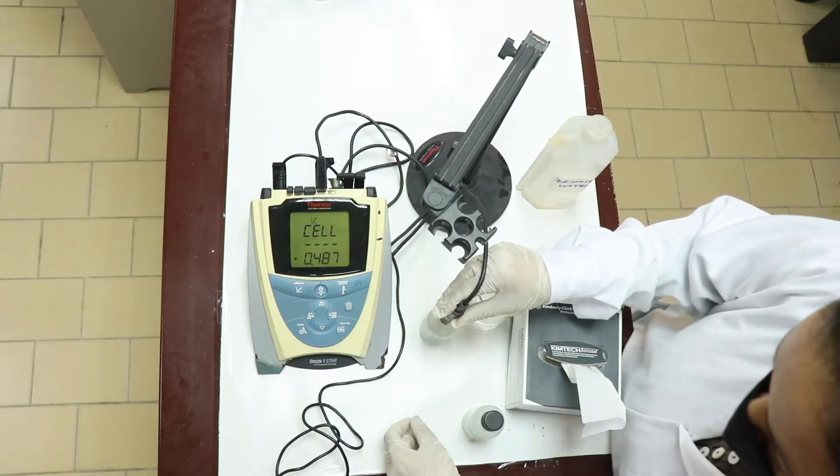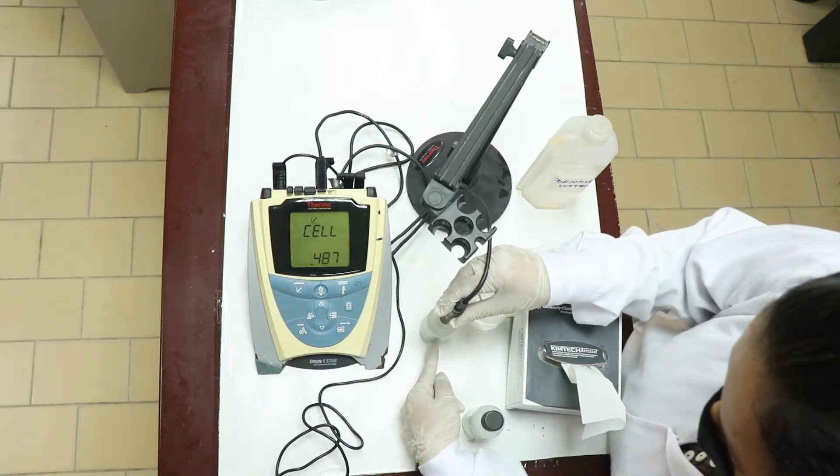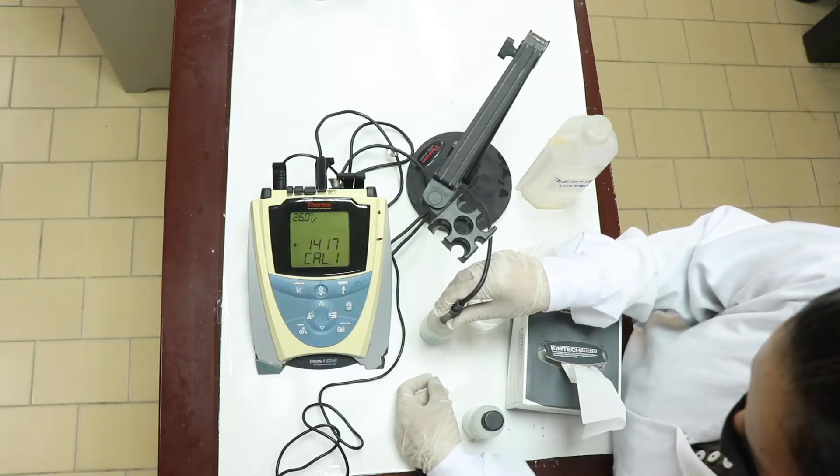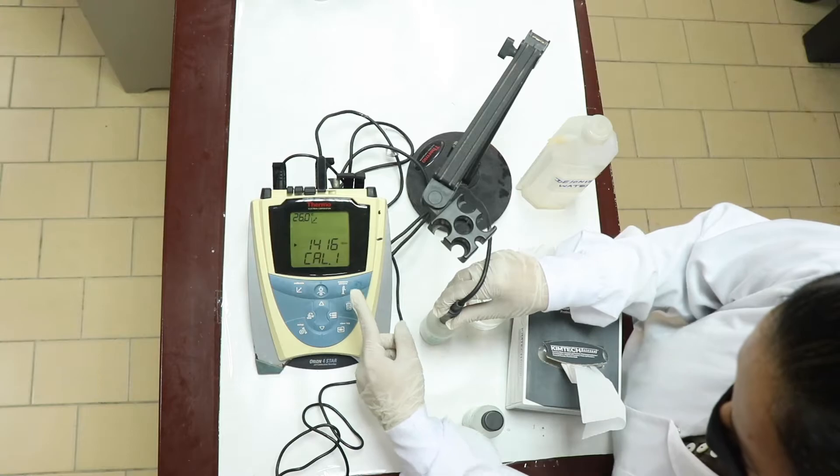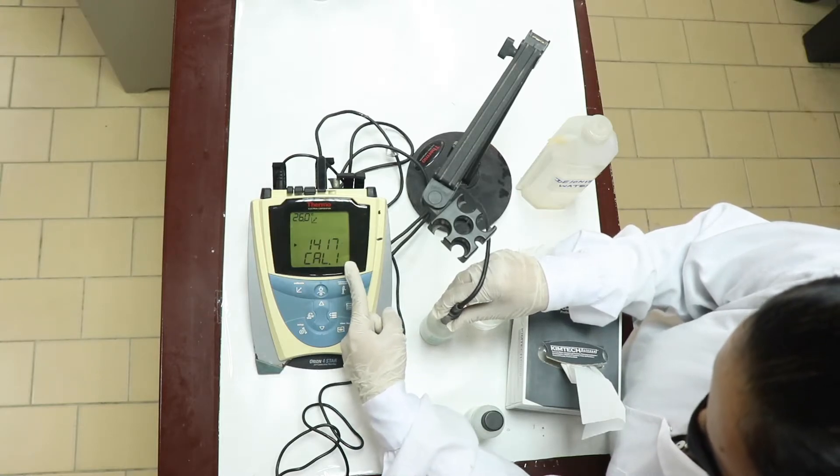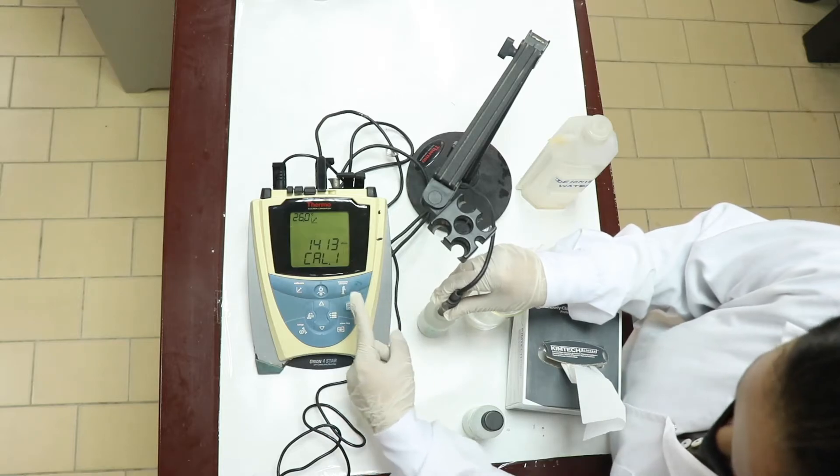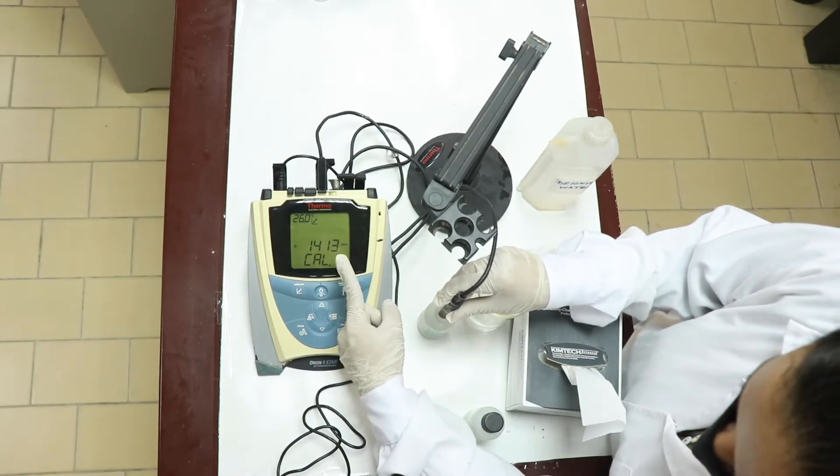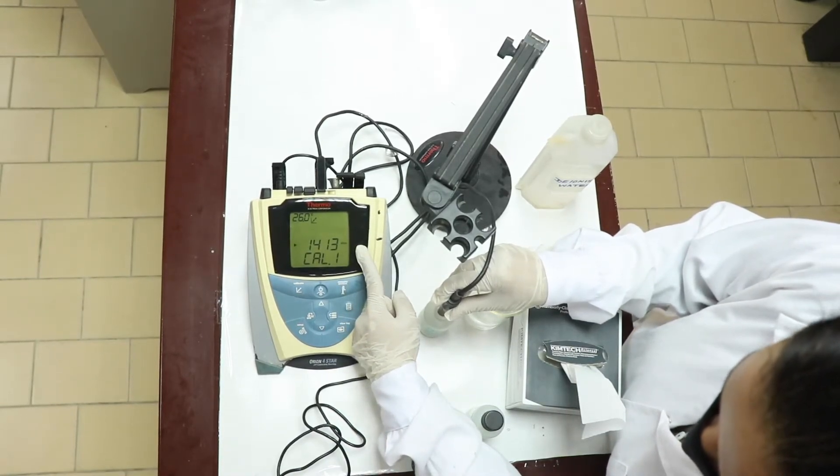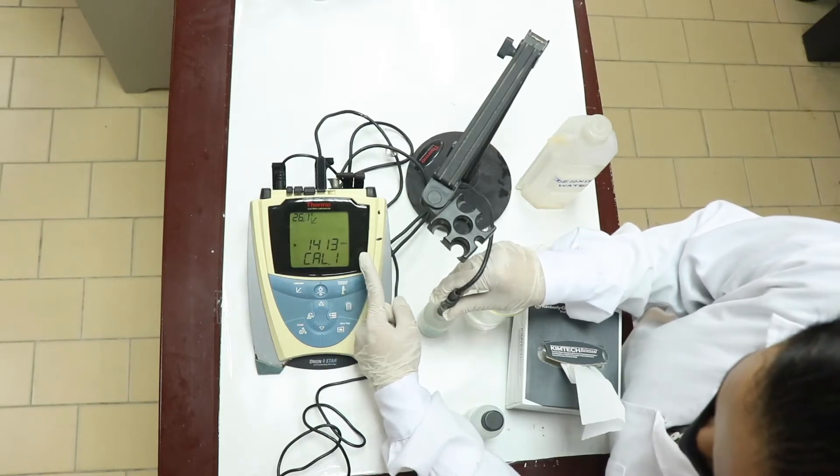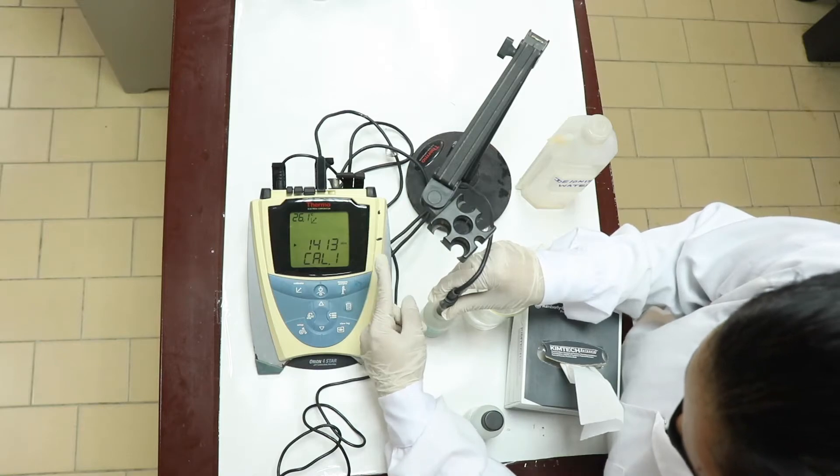The machine is now trying to read this value. You have to wait until this value appears on the screen. You can see the number 1416 has come. It is now fluctuating. You can see now it is 1413 and the unit is stagnant. The unit is not fluctuating. That means the calibration process is complete now for the first solution.